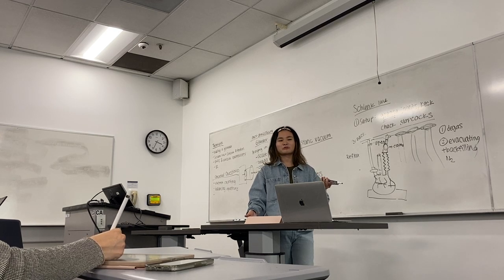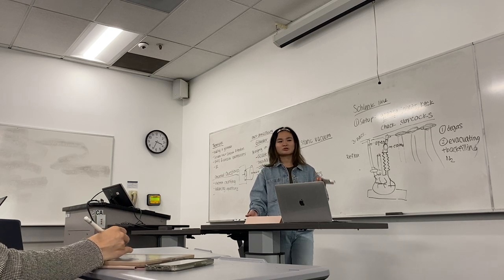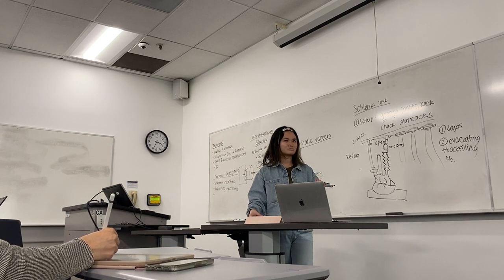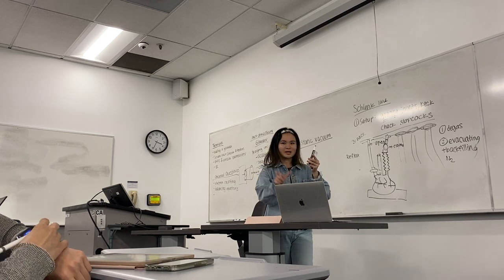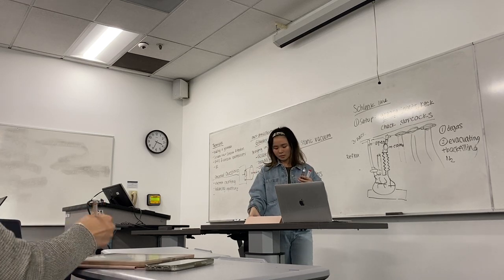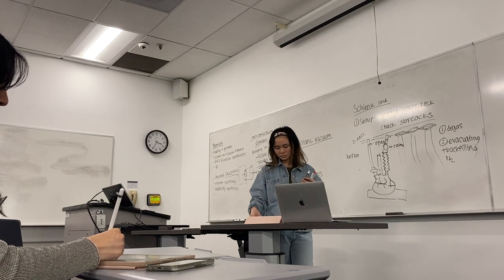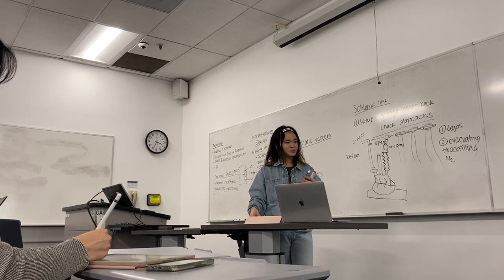I guess the technical biggest hazard in this lab, if we put up the liquid nitrogen traps, would be liquid oxygen condensing into the trap. But we didn't do that. But they mentioned it in a lot of lab guides. Needle safety?